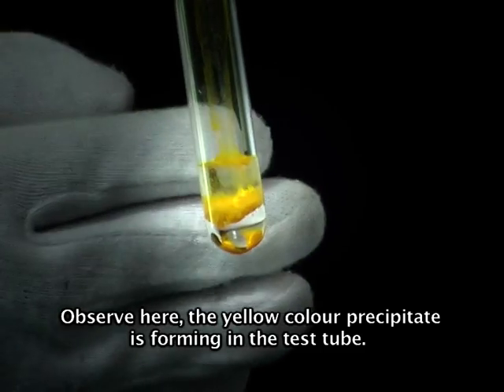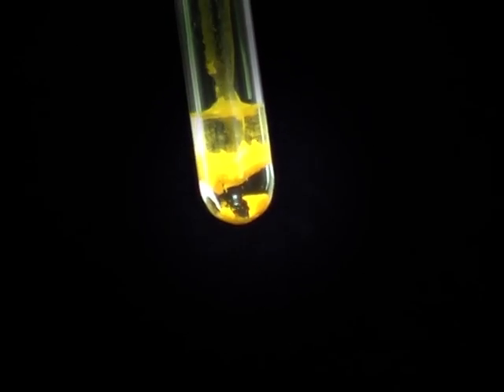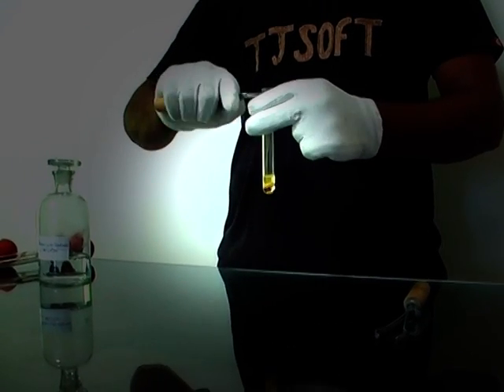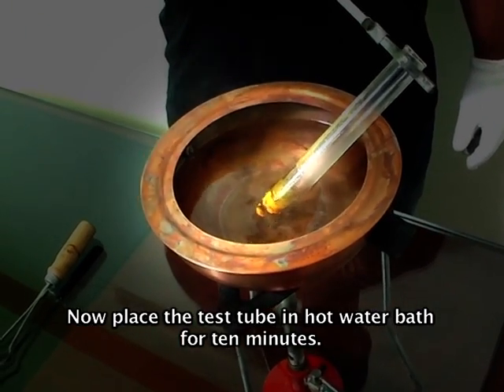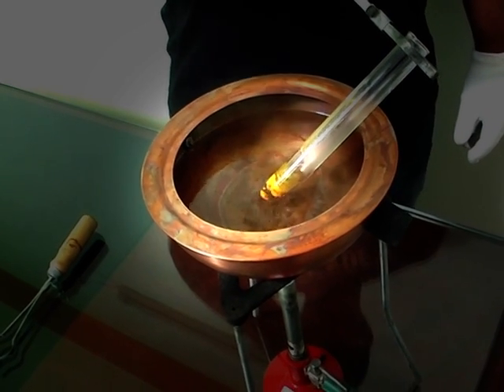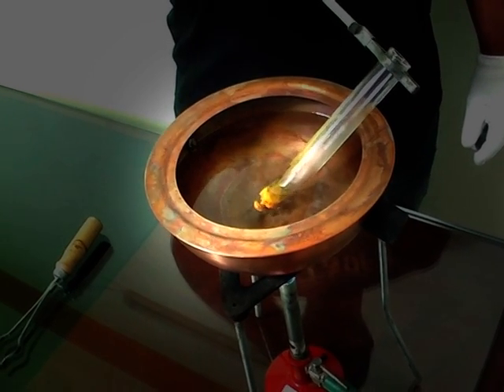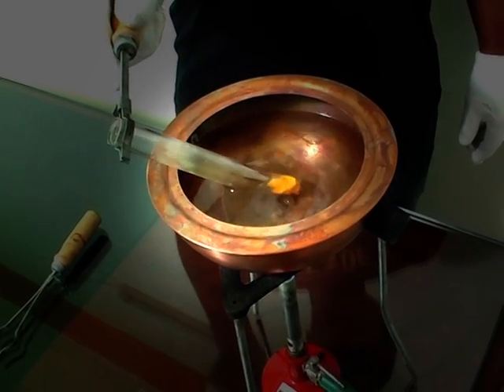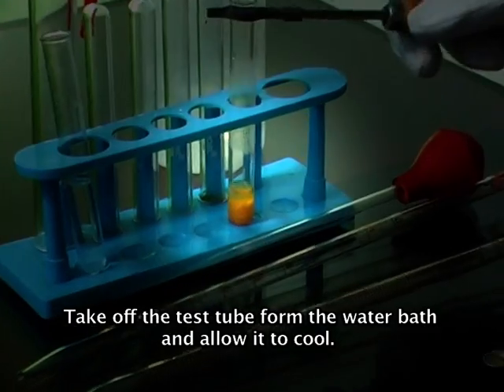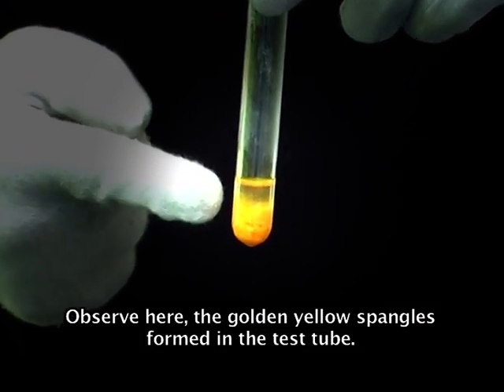Observe here — a yellow color precipitate is forming in the test tube. Now hold it with a holder and place the test tube in a hot water bath for 10 minutes. Take off the test tube from the water bath and allow it to cool. Observe here the golden yellow crystals formed in the test tube.